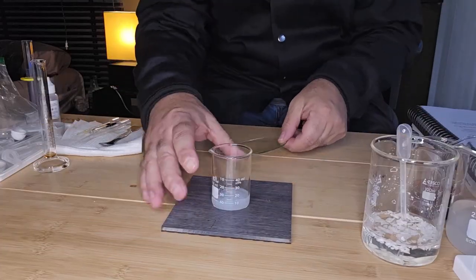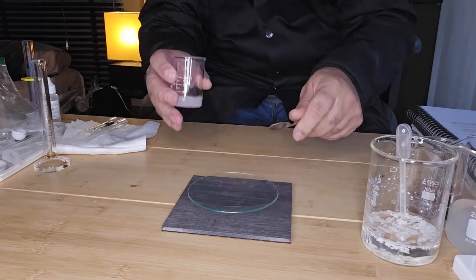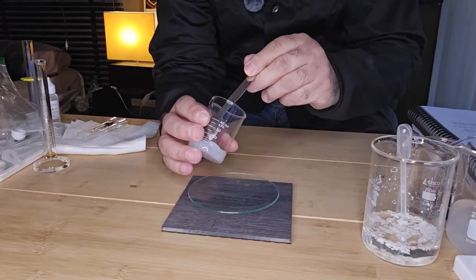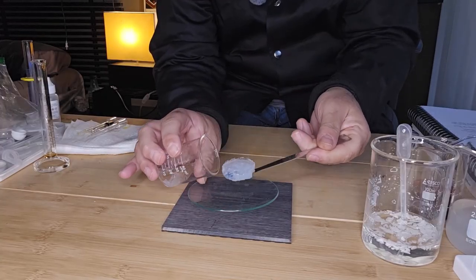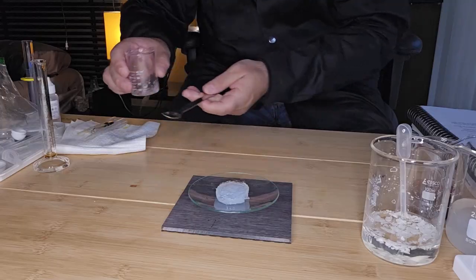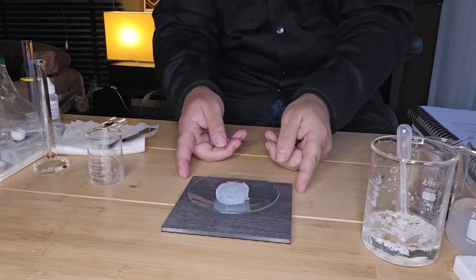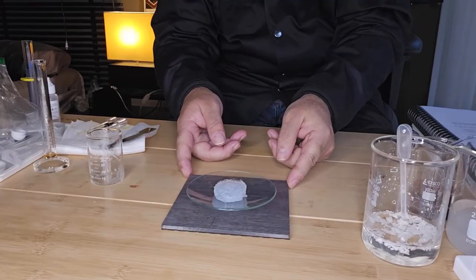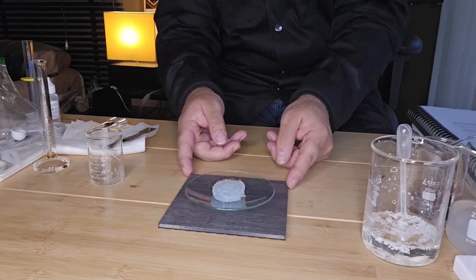Okay, so now what I'm going to do is put some of this gel onto my watch glass, and then I'm going to turn off the lights and apply a wooden splint flame to the gel. Okay.